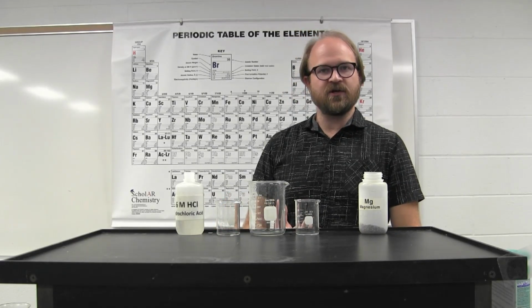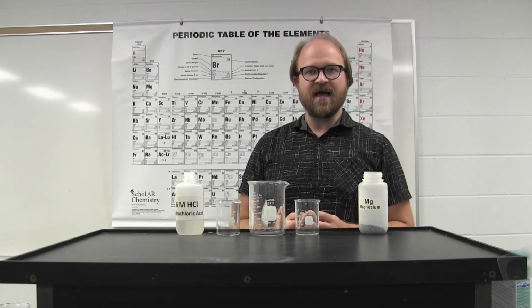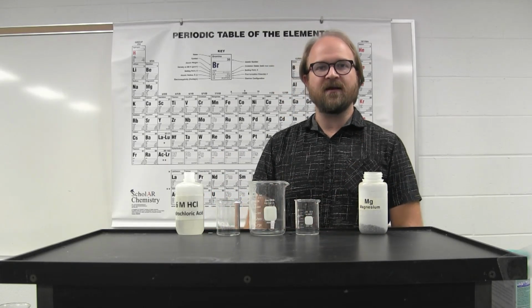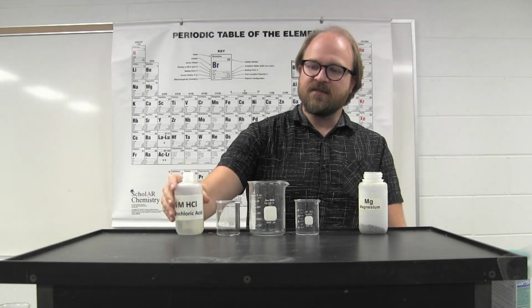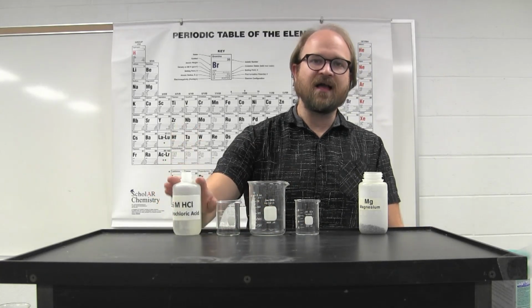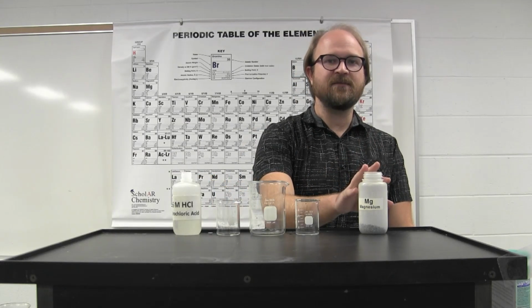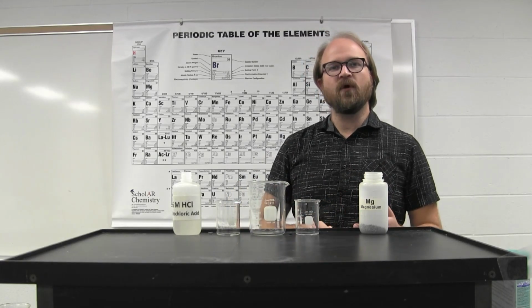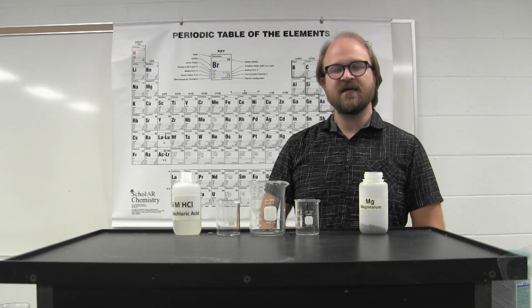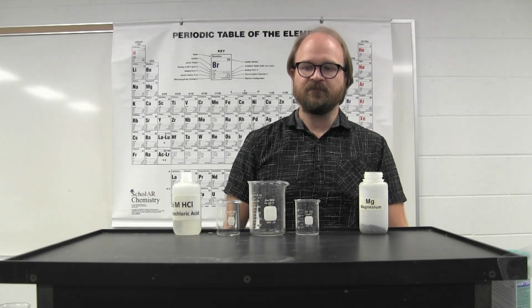When a reaction occurs, you're taking the reactants, rearranging those atoms and electrons, and creating the products. In this example, there are two reactants: hydrochloric acid, HCl, and magnesium metal. And when these two things react, they form hydrogen gas and a solution of magnesium chloride.